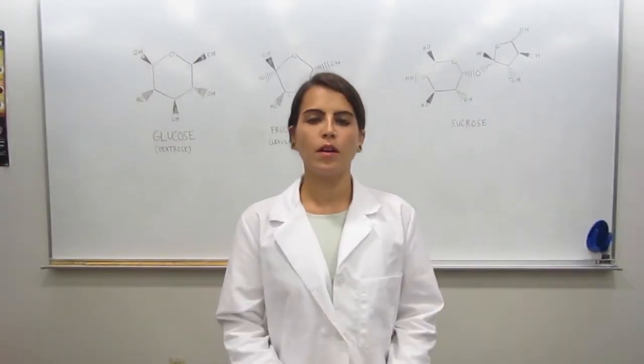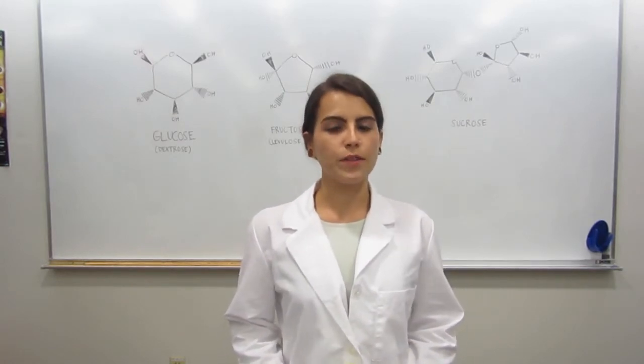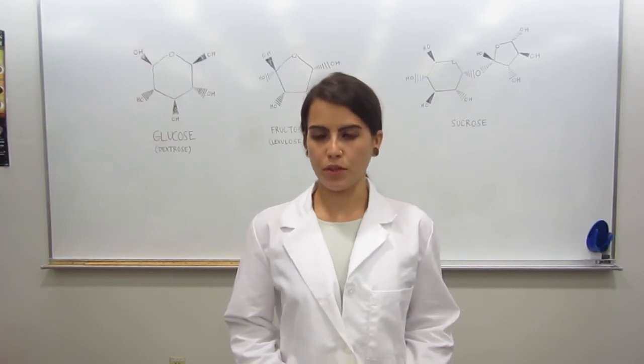We are currently enrolled in General Chemistry 2 and Principles of Biology 1, with Professor David Finneran and Professor Juan Morata. This afternoon we will be presenting our final research project where we tested the inhibitive antimicrobial properties of Florida orange blossom honey, raw agave, and blackstrap molasses against 4 different strains of bacteria: Bacillus cereus, Escherichia coli, Pseudomonas aeruginosa, and Staphylococcus aureus. For our project, we used Florida orange blossom honey, raw and unfiltered, sourced directly from West Palm Beach, Florida.